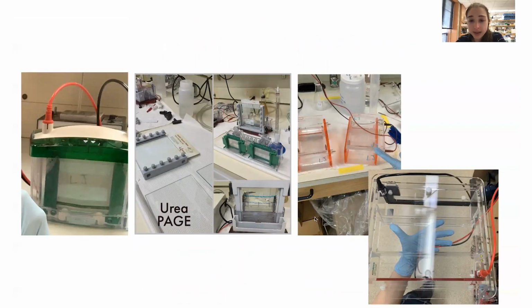If we want to deal with DNA or RNA, here it's going to depend on the size of the molecules that we want to separate. Sometimes if we're dealing with big molecules, we can use an agarose gel. So this is one of the typical agarose gels you probably do in labs that you might do in school or that sort of thing. These are the ones that we use in our lab most of the time, these small ones. But for a lot of cases, when you're doing this sort of high intensity southern blotting stuff, or northern blotting, whatever, you're using a bigger box. So this is an example of a bigger gel box. So same type of thing, but on a lot bigger scale.